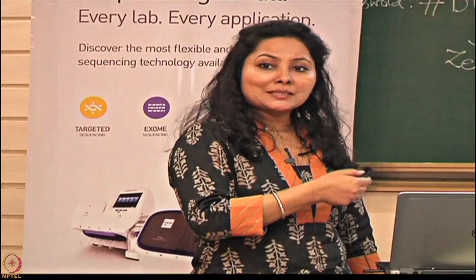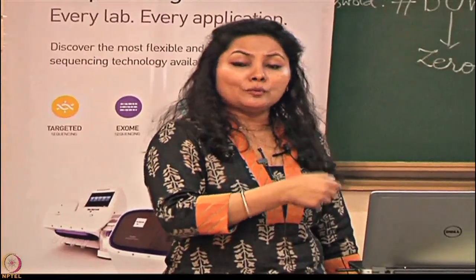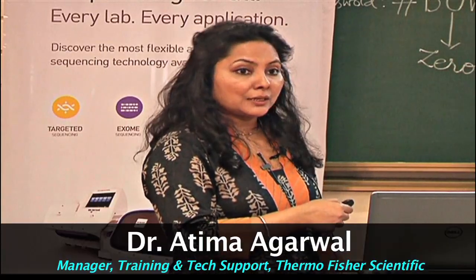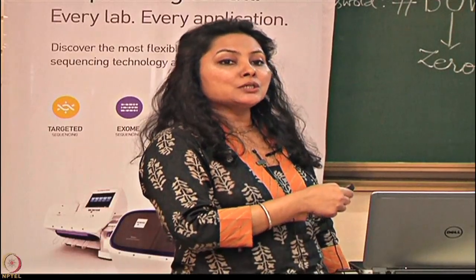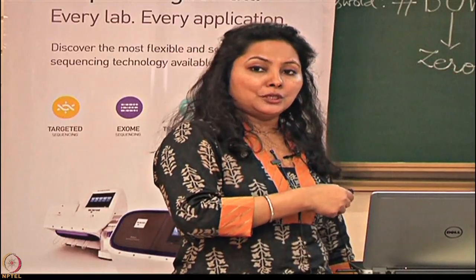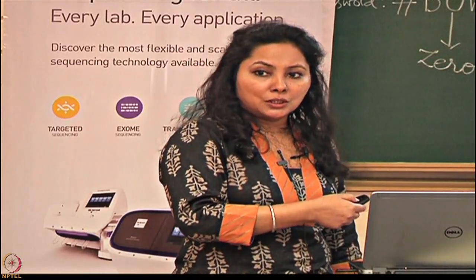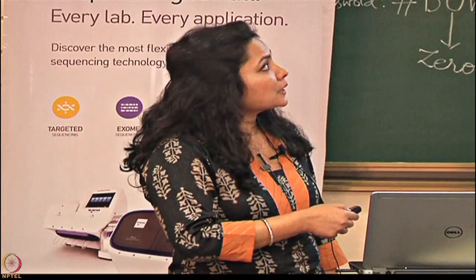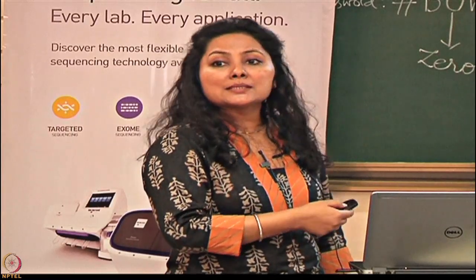So the release of so many hydrogen ions in one well brings about a change in pH for that particular well, yeah. And that change in pH is recorded as a change in voltage. So basically you are converting chemical information into digital information, and that is how you say that a signal has been received and a base has been called.